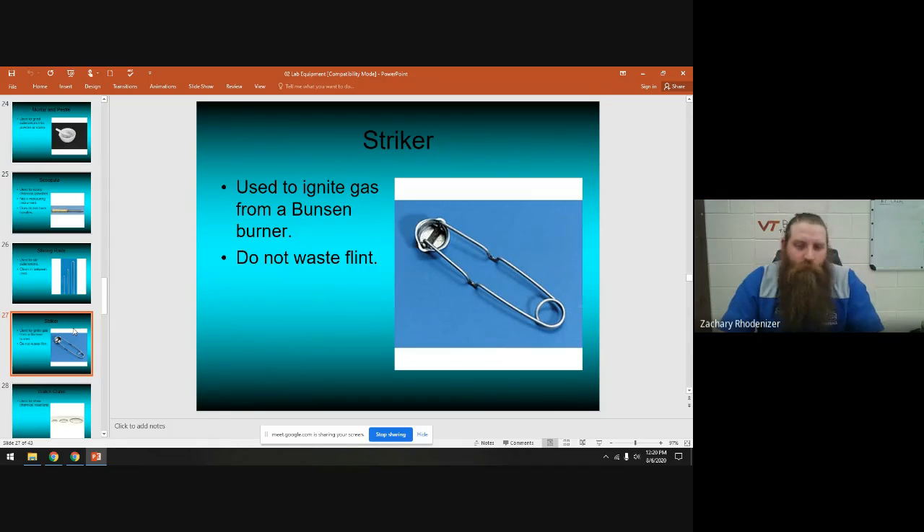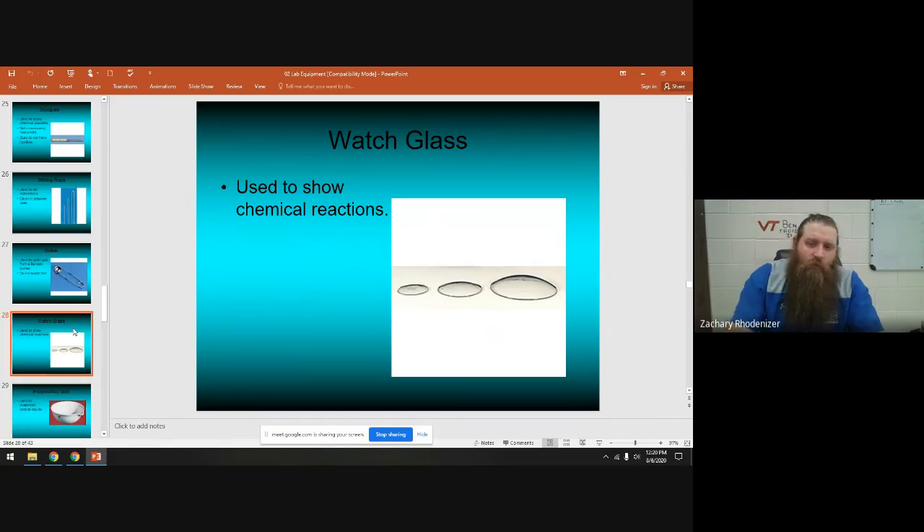This is a striker — don't sit there striking it repeatedly making noise because it wears the flint out. I'll show you how to light a Bunsen burner with a striker. This is called a watch glass — these little bowls. You actually use them flipped the other way up. They're a great way to do a small chemical reaction and observe it; you can also put things in there to evaporate.